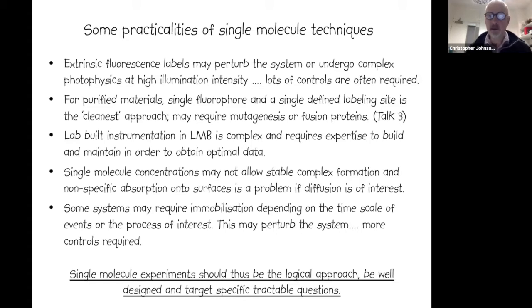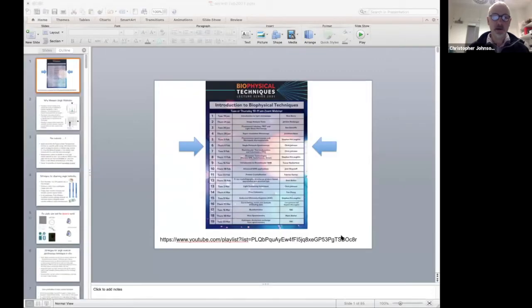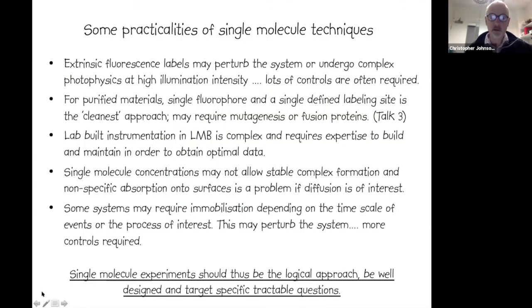So single molecule experiments, when you come to thinking about doing them, should be a very logical approach that's required for your project. And the experiments should be well designed, and they should try and target a specific tractable question, because you may have to undergo some amount of additional work to get to the point where you can make the measurements.